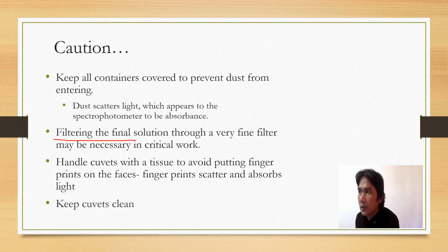So preparation of solution is very critical, no? Before you measure, your solution must be homogeneous. Okay, colloids or suspensions do not work. Okay, handle the cuvettes with tissue paper or soft tissue to avoid putting fingerprints on the faces.